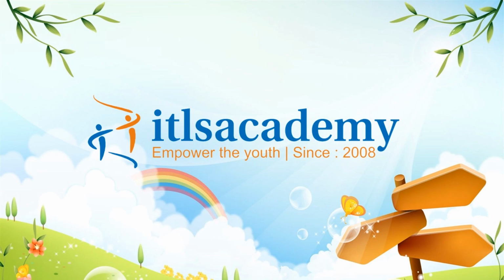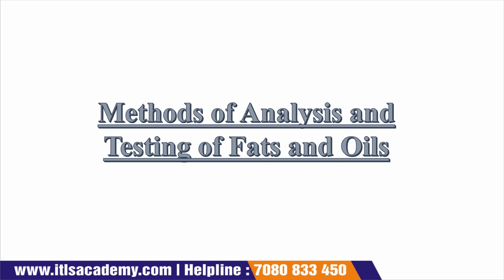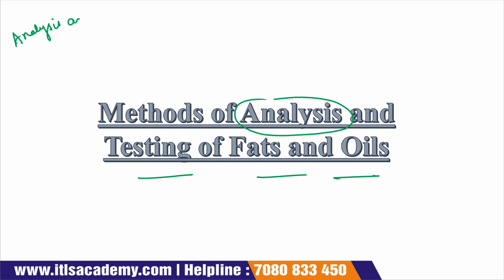Today we are going to discuss the topic that is the method of analysis and testing of fats and oil. So in today's lecture, we are going to study the different methods for the analysis and testing of fats and oil. Analysis and testing of fats is very important.